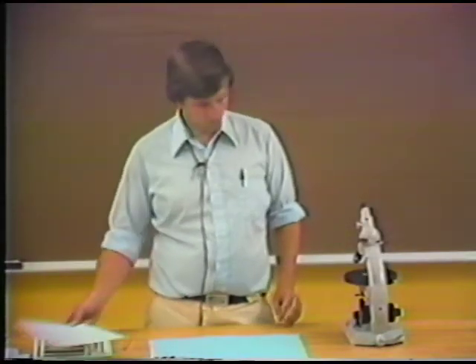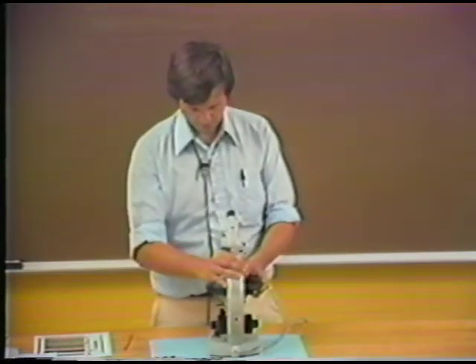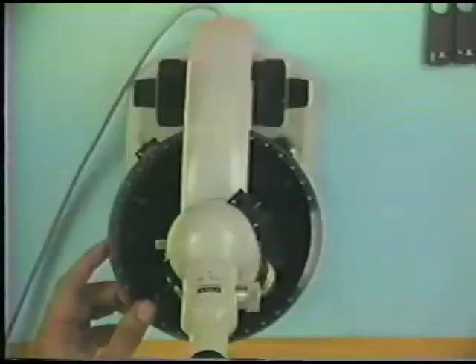For example, I can go to a thin section of a sandstone. This is a thin section we've looked at previously, but contains virtually all of the mineral quartz. And if we look at this now in cross-polarized light, you can see that the maximum interference color that's shown by these quartz grains is still only a first-order white.